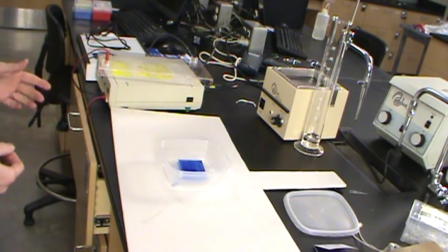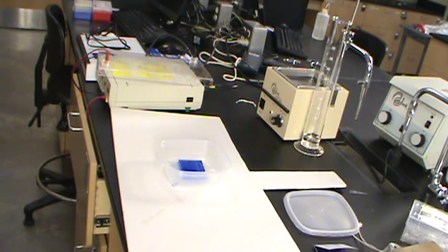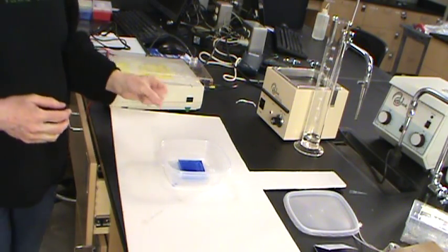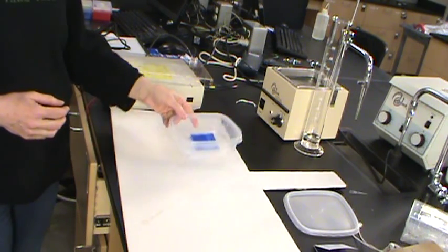After that, we're going to put the gel on a light box and take a picture of it, and you'll be able to do the work with analyzing your fragments to see which of the suspect DNAs looks more like the DNA that was collected at the simulated crime scene, and you'll be able to measure the relative mobilities of each of the bands.